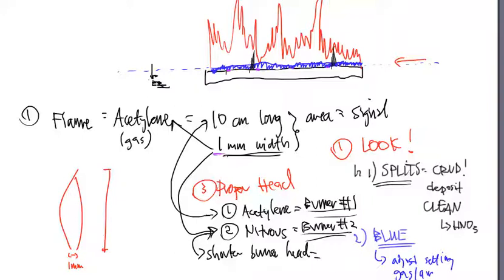There's a couple of areas here that we want to talk about. Now remember, down here at the bottom, I said this is your blue area. This is where your sample measurements are going to be made. That blue area is called the primary combustion zone. It is the brightest part of the flame, and it's the deepest blue part of the flame.